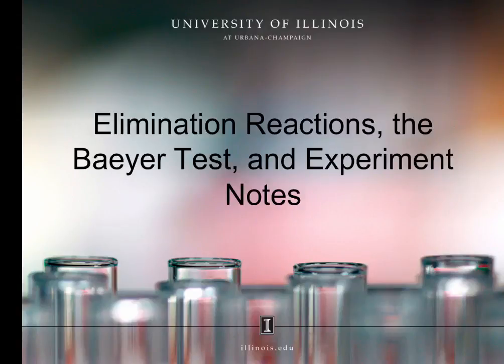Elimination reactions, the Baeyer test, and experiment notes. In this webcast, we will discuss the chemical reaction aspects of the unimolecular elimination experiment. In the previous experiment, you performed a unimolecular nucleophilic substitution reaction. You know from Chem 232 that substitution and elimination reactions are often in competition with each other. Let us begin this webcast by discussing that topic.